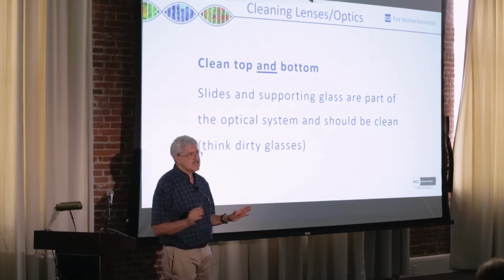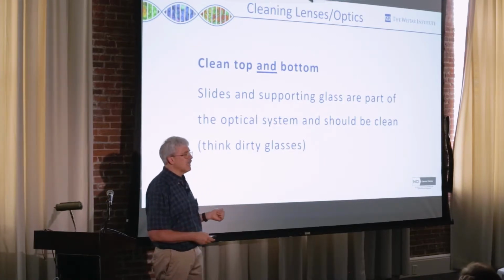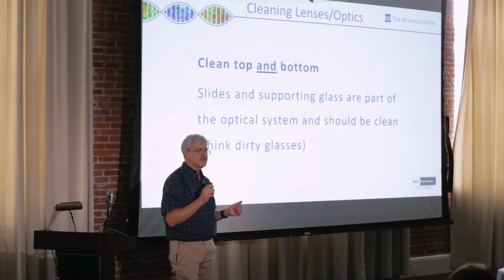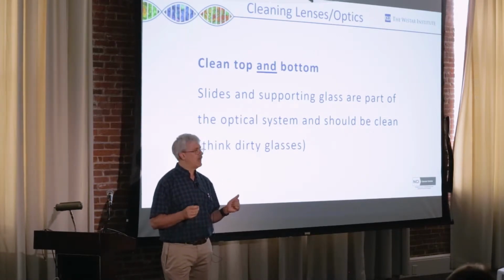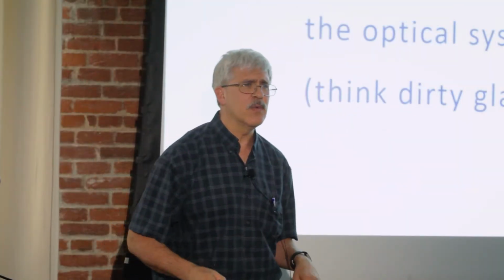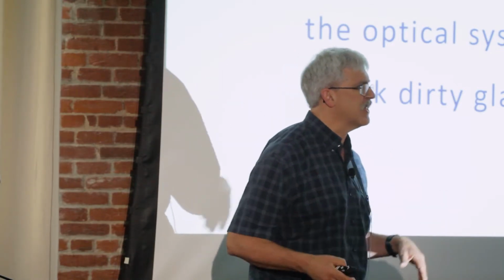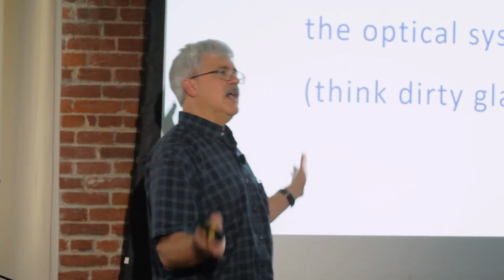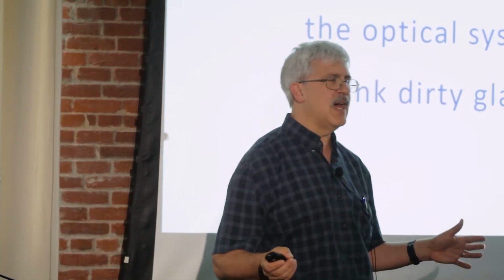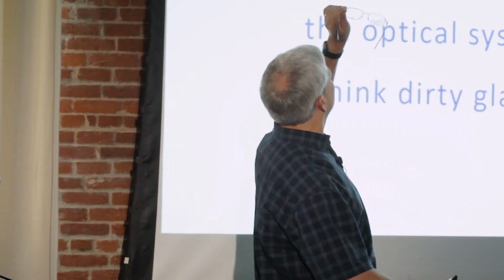In a transmitted system, which is what we're talking about first, standard bright field imaging, any glass in the entire system has the ability to have dirt on it, have dust on it. Now, how many people in here wear glasses? It looks like a lot of you wear glasses or contacts. All of us, at least several times a day, have said, oh my God, was I looking through those?